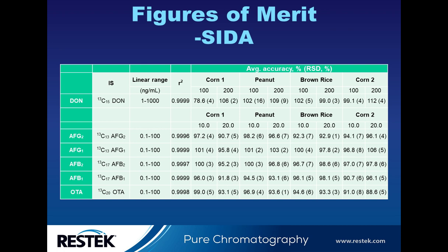However, something didn't look right. I know you will ask me this question: I have 12 mycotoxins, but why do I only show 6 of them? Well, I have to be honest with you. When I first started this work, I would like to save some money. So I didn't purchase all the stable isotope-labeled internal standards for all the 12 mycotoxins. In the hope that I could share some of the internal standards, I only bought those 6 internal standards. But it turned out it is not good. It is a really bad decision.